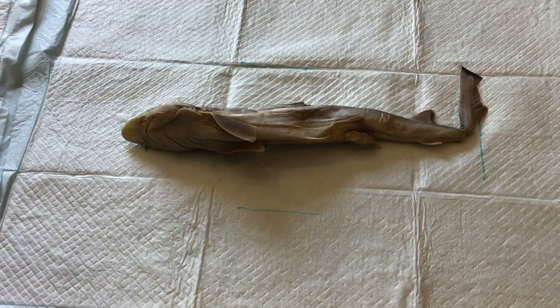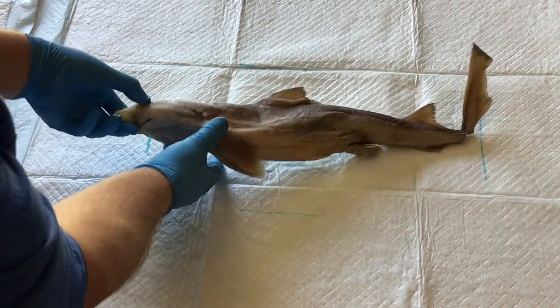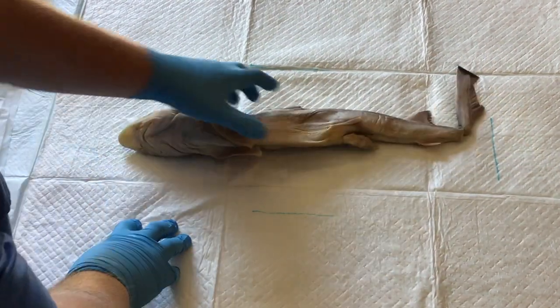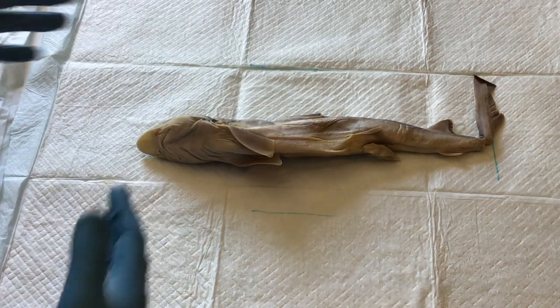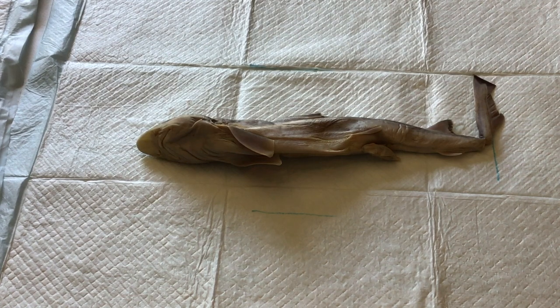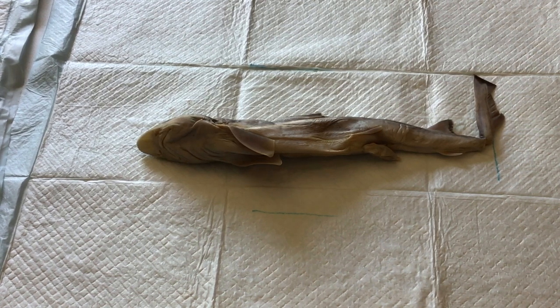One of the things that's very hard to see on camera is going to be the little gills. The biggest thing about sharks is that they typically breathe in through their mouth. They take in water through their mouth and it passes over a set of internal gills, and we might be able to see those when I cut this up today. Then once the water is returned, it goes back out through these external gills.